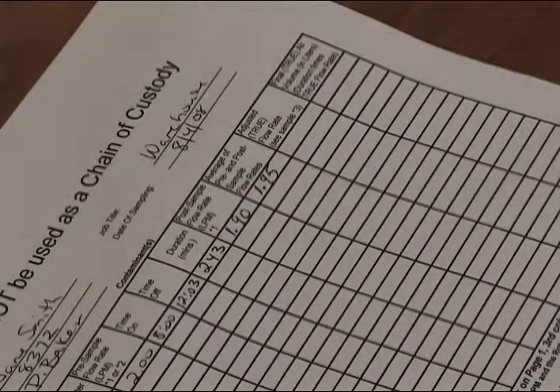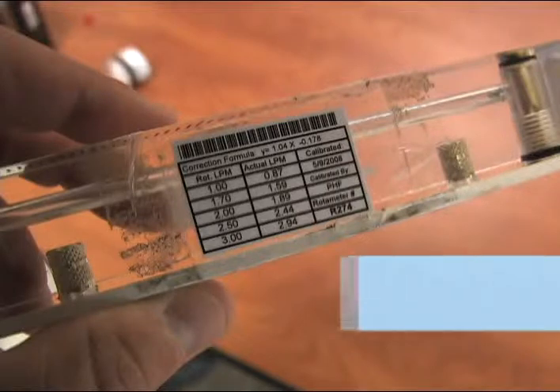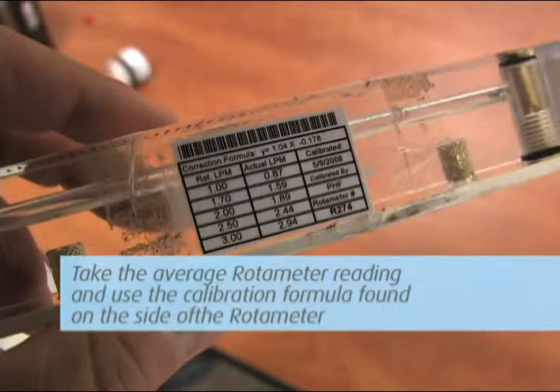All rotometers are calibrated against a primary standard quarterly. This calibration formula is located on the side of the rotometer. Take the average rotometer reading and plug it into the calibration formula where the X is to determine your actual flow rate.